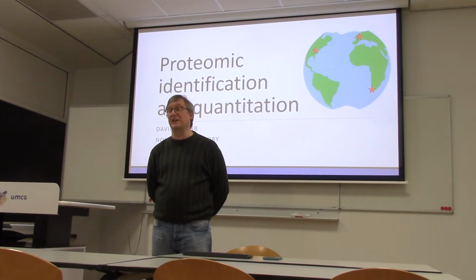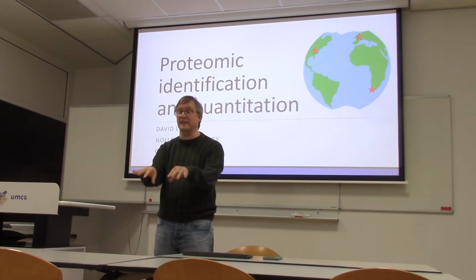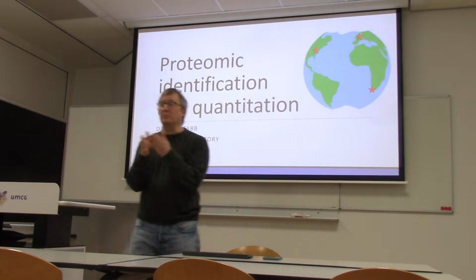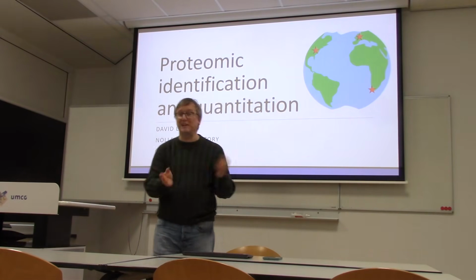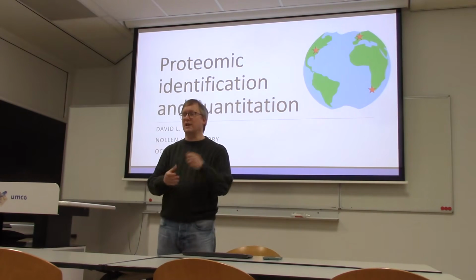We're going to start with a lot of lecture this morning from 10 to noon. We're then going to take an hour for lunch and then come back to do some hands-on data analysis with real files. So I hope that this will be useful for you to have some theory about how proteomics works and some hands-on practice for how it plays out. We've got a sign-up sheet that's passing around, so feel free to add your name to the roster.